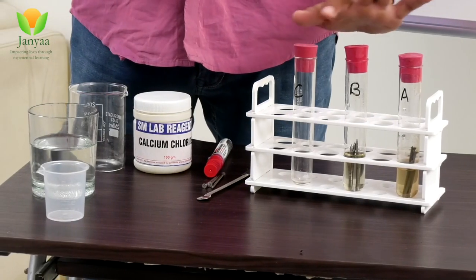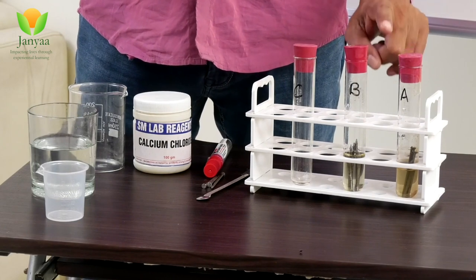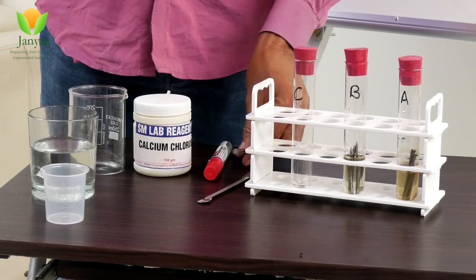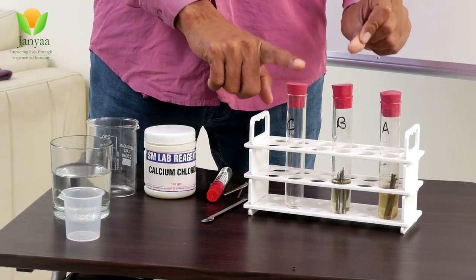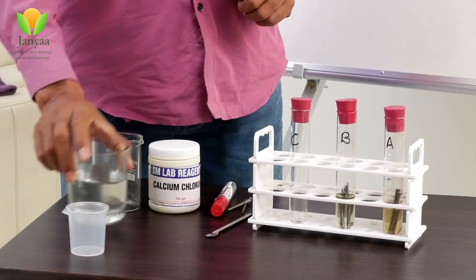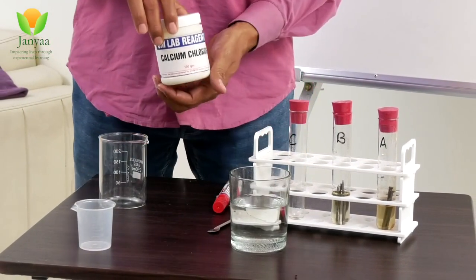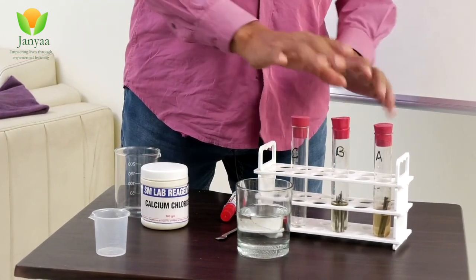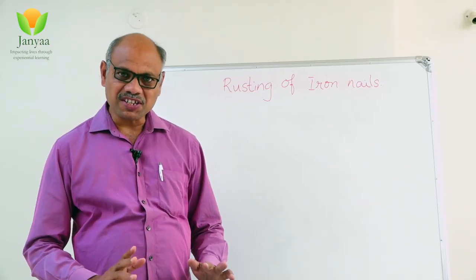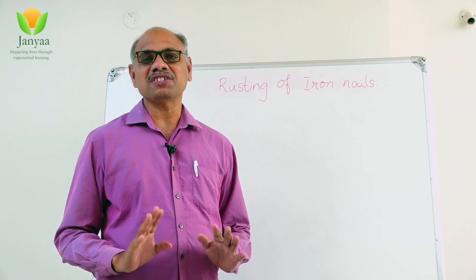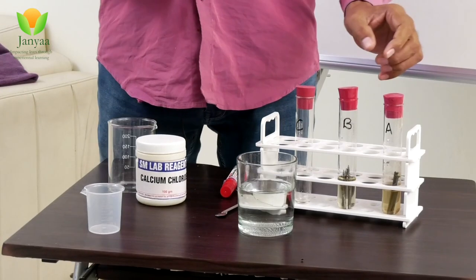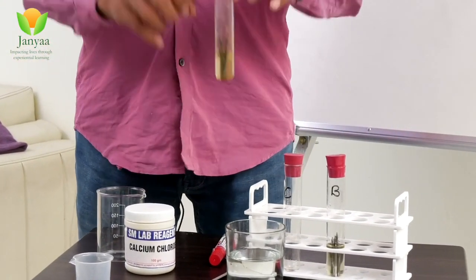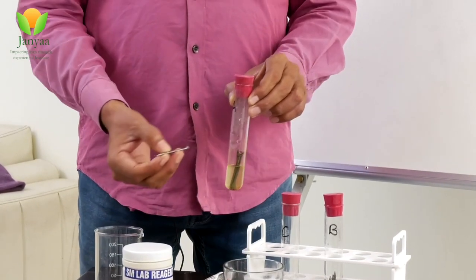Let us do a simple experiment. I have taken three test tubes marked A, B, and C, and some iron nails. We have used rubber corks, some water, anhydrous calcium chloride, and some oil. With these materials let us test at what condition iron gets rust.